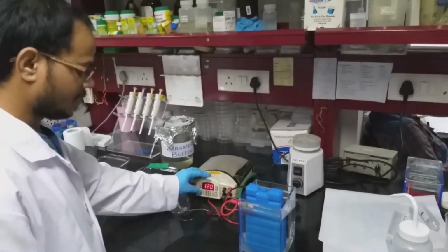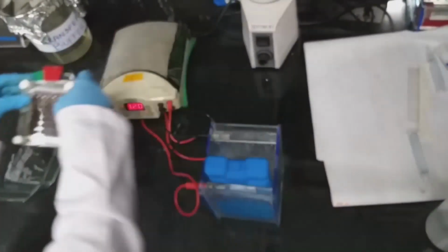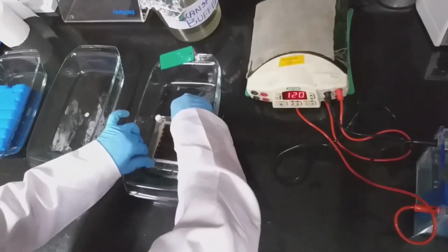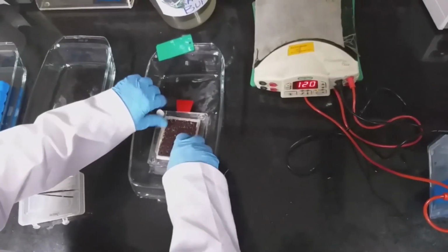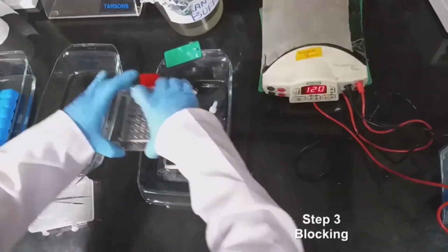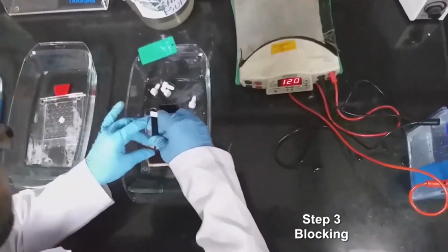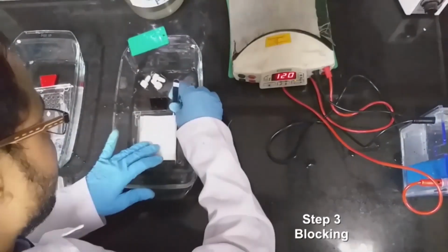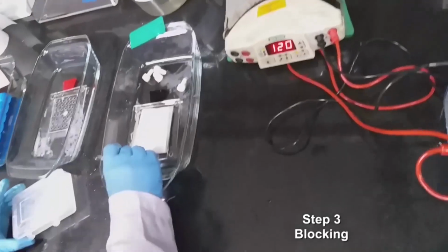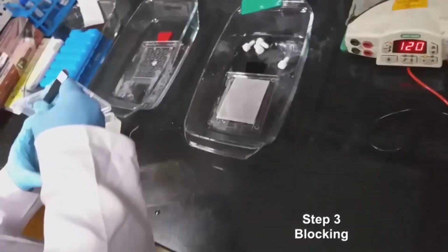So I am going to stop here. Remove the cassette, keep it in a tray. Remove the screws properly. Gently remove the sponges. Take out the blot and keep it in blocking buffer.